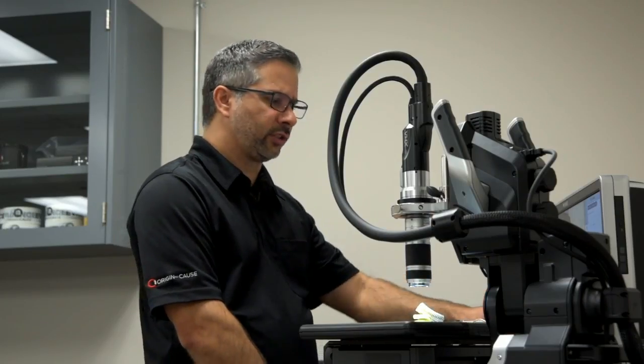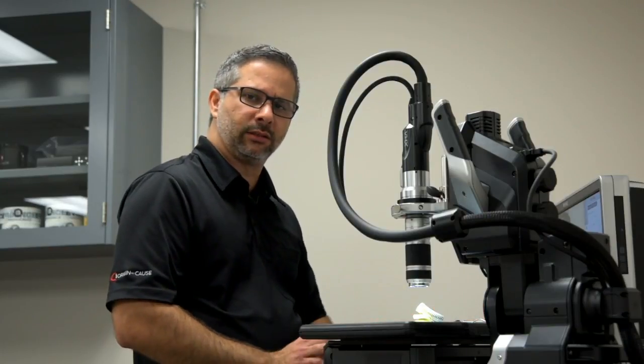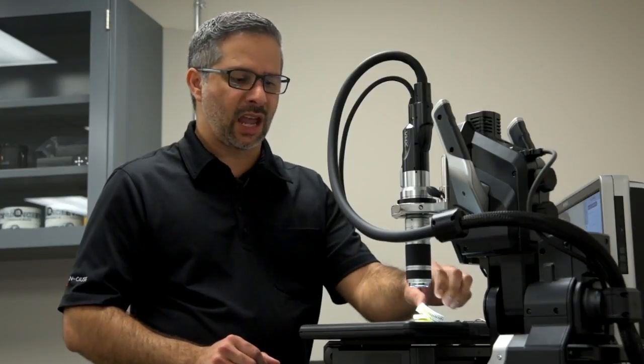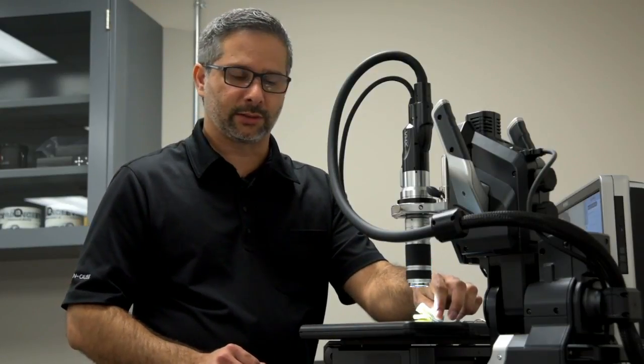That's normal. The water tends to do that to the plastic tube. Basically, a very smooth surface. There's no cracking, there's no damage whatsoever. Now let me show you how a damaged inner tube looks.